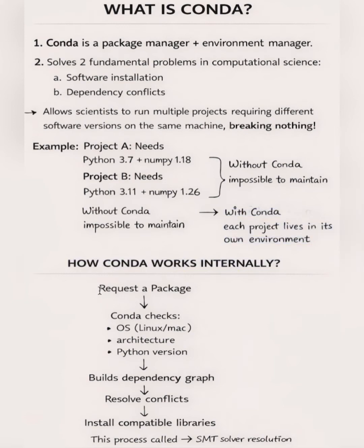How conda works internally? Now let's understand how conda works internally. You request a package. For example, you run a command to install FastQC or Python. Conda checks your system. It checks the operating system, whether it is Linux or Mac. It checks system architecture and Python version.